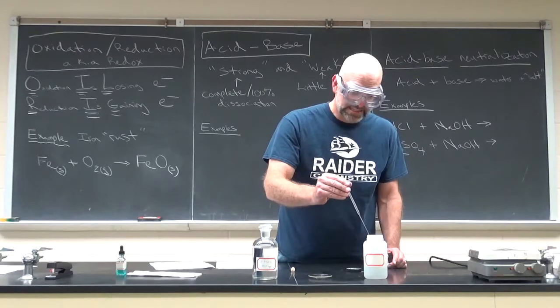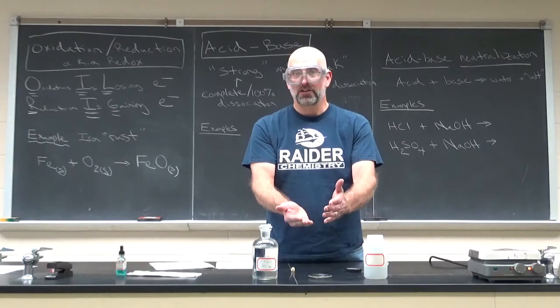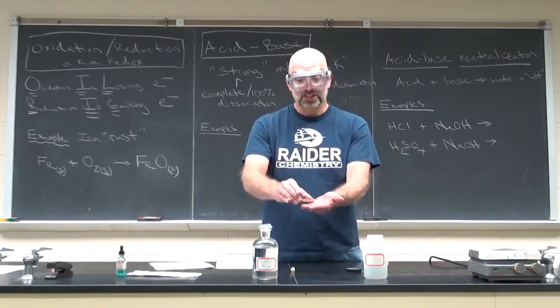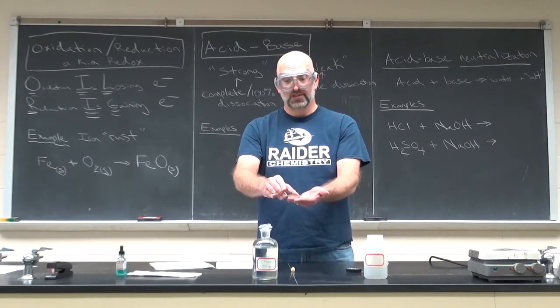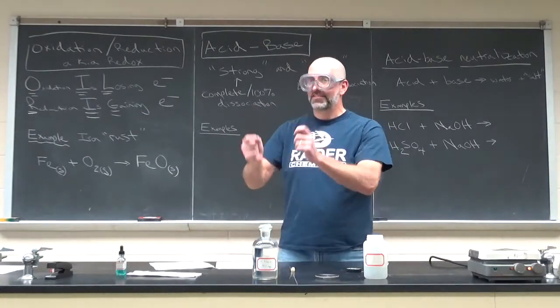I don't know if you can see it. I can see a little bit of this. I don't think you can see it. A little bit of water vapor actually came off when I added these two together. What does that mean? This is a pretty exothermic reaction. The bottom of the watch glass is very warm. It's much warmer than it was. So that's actually something from the last acid-base reaction. We're going to measure how high the temperature goes.